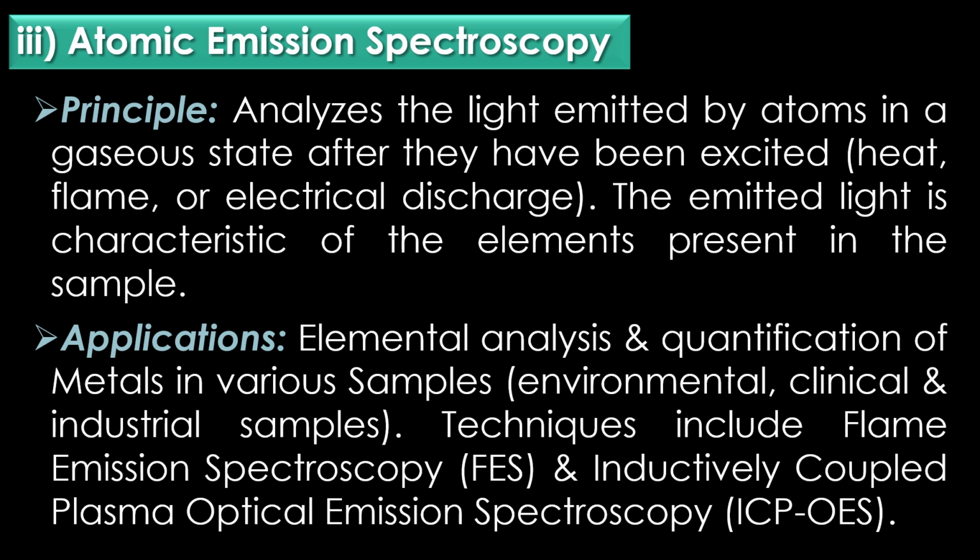Regarding applications, atomic emission spectroscopy is commonly used in analytical chemistry for elemental analysis and quantification of metals in various samples, including environmental, clinical, and industrial samples. Techniques include flame emission spectroscopy or FES and inductively coupled plasma optical emission spectroscopy or ICP-OES.